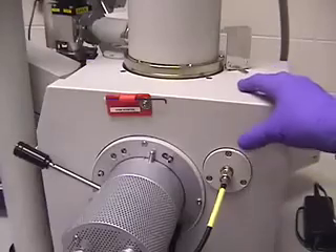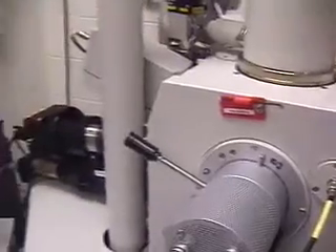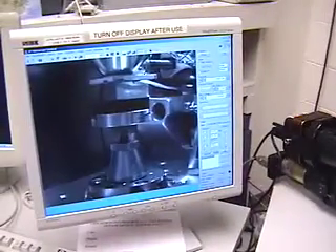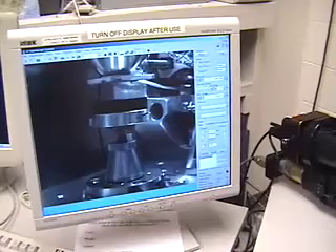With the specimen chamber door closed, hold it firmly with your right hand while you use your left hand on the mouse to click on pump. Here is a closer look at the pump button.